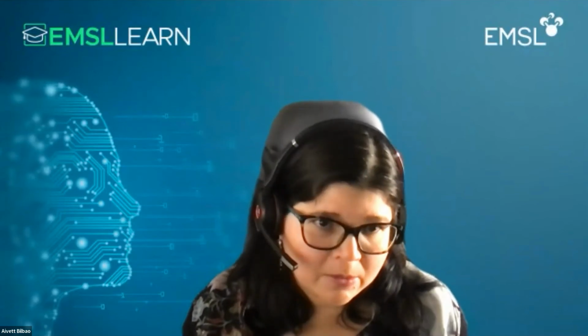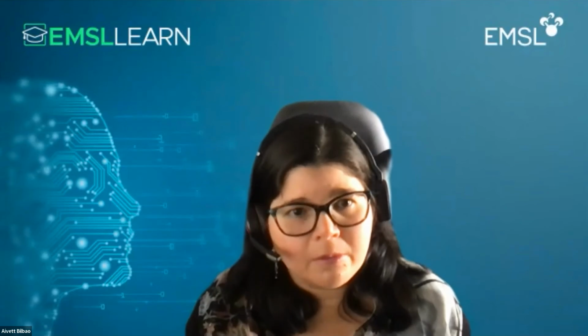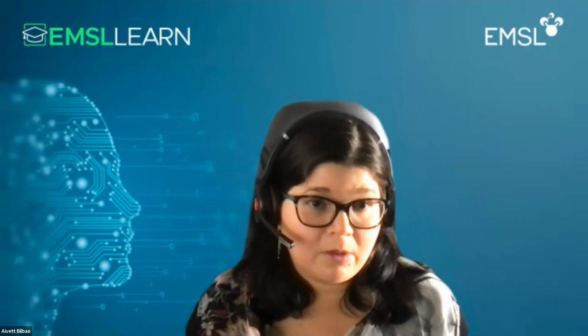We can help you navigate the code. If you want to implement new functions yourself, the other mechanism is to submit a proposal to EMSL calls and specify that you need new functions built using Isoforma or PSpecteR, and then we are happy to help with those. Again, please contact us if that's something you are interested in and we can discuss further.